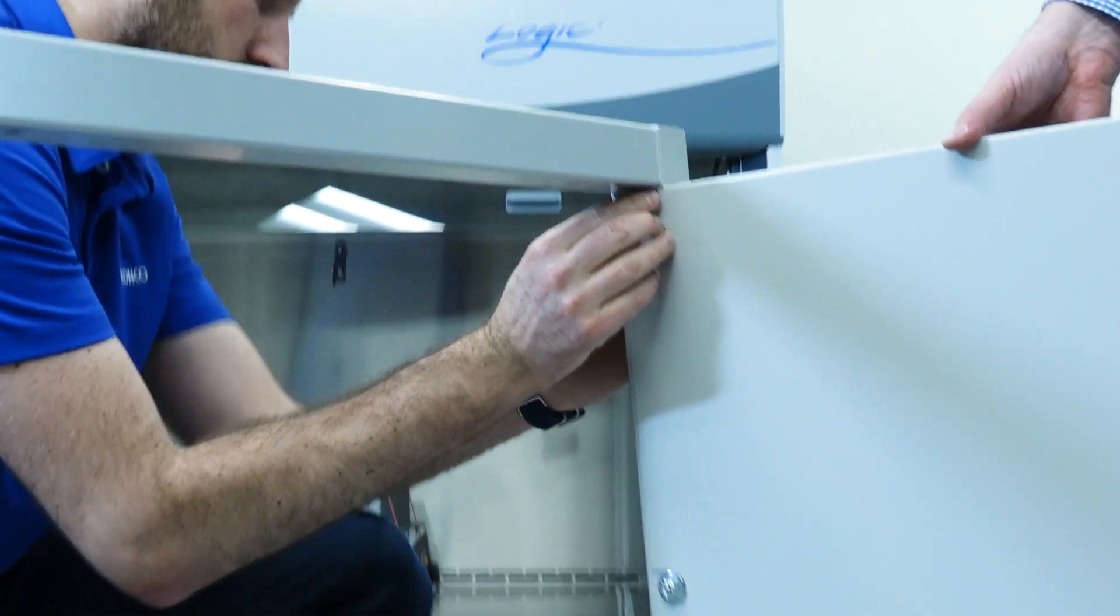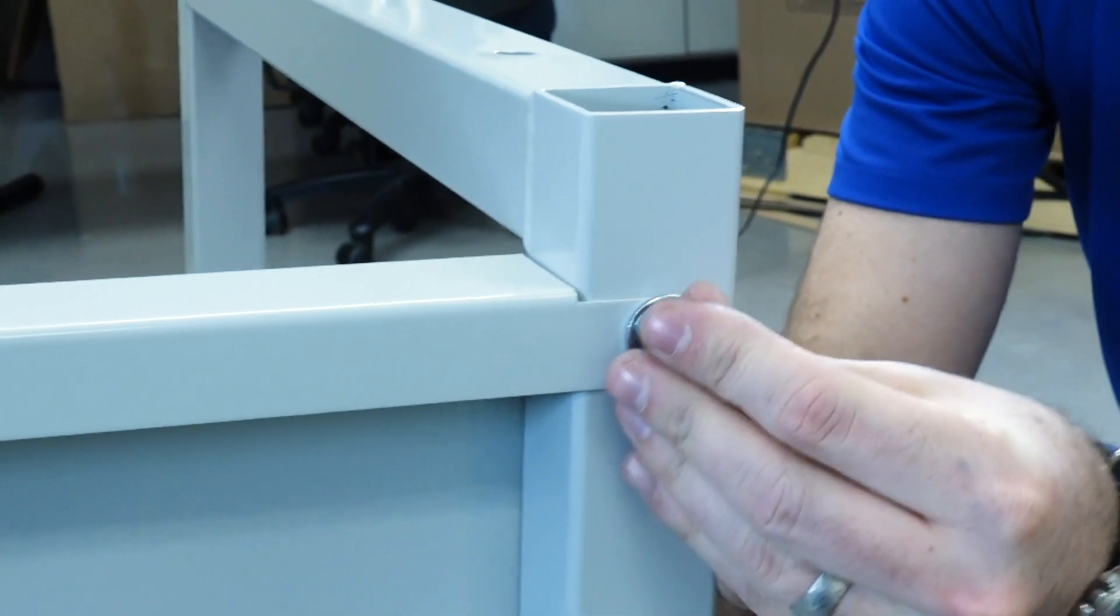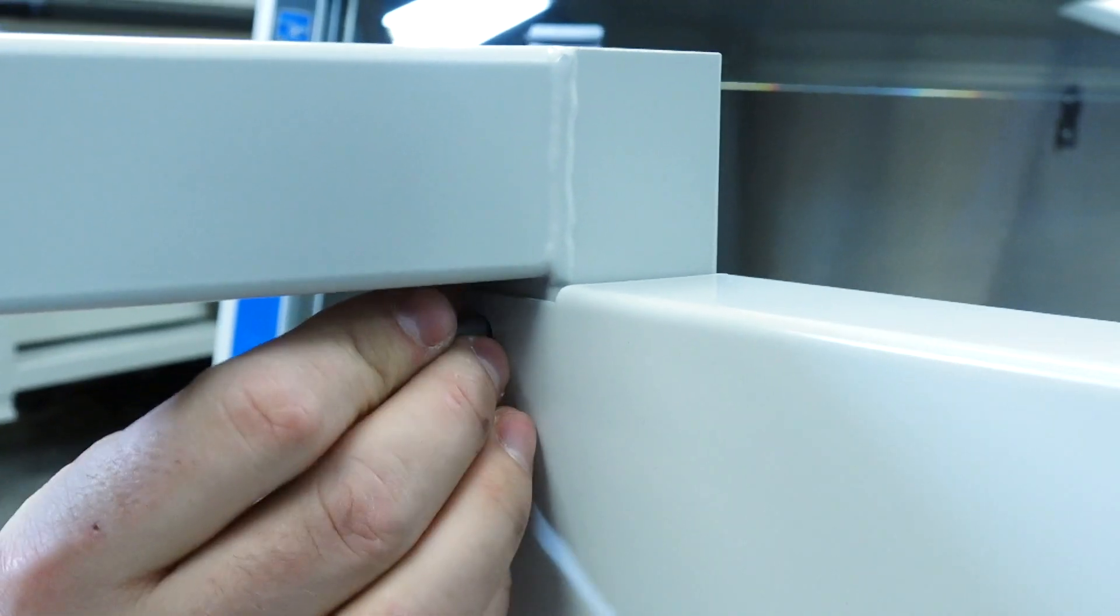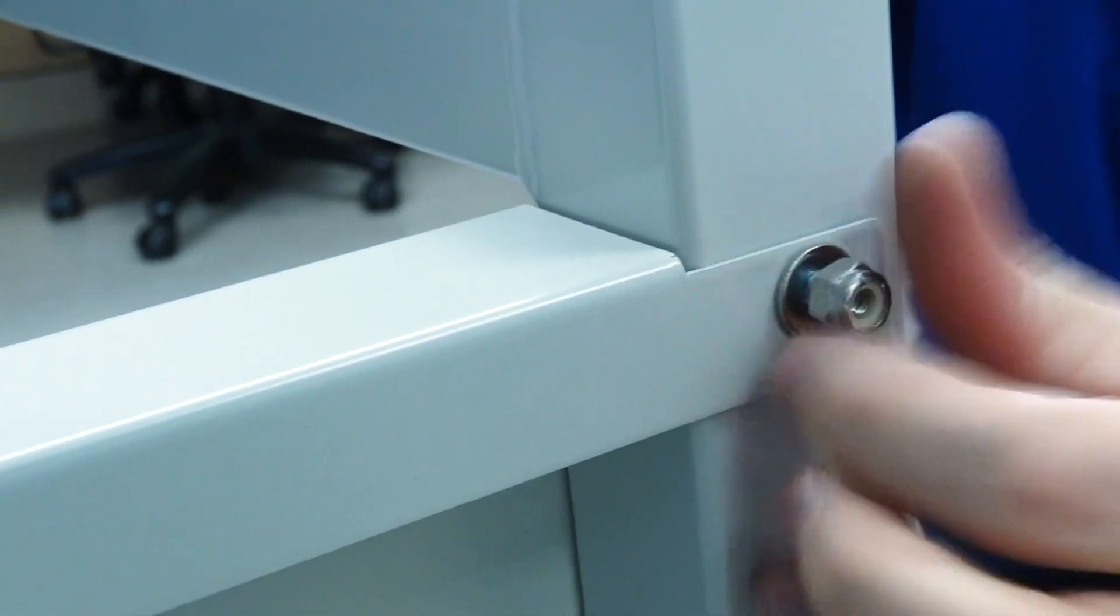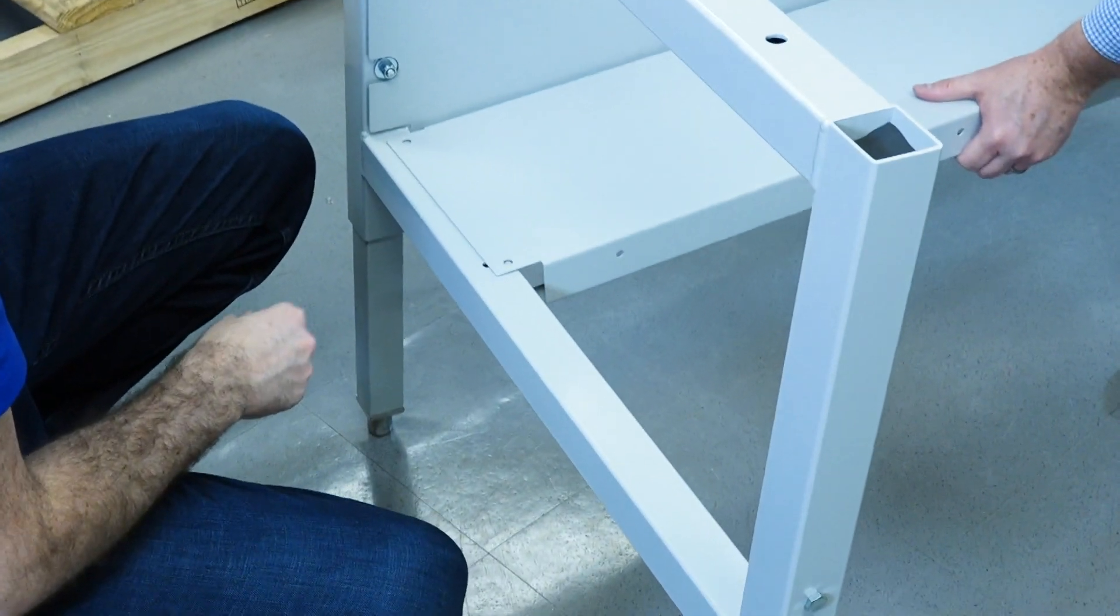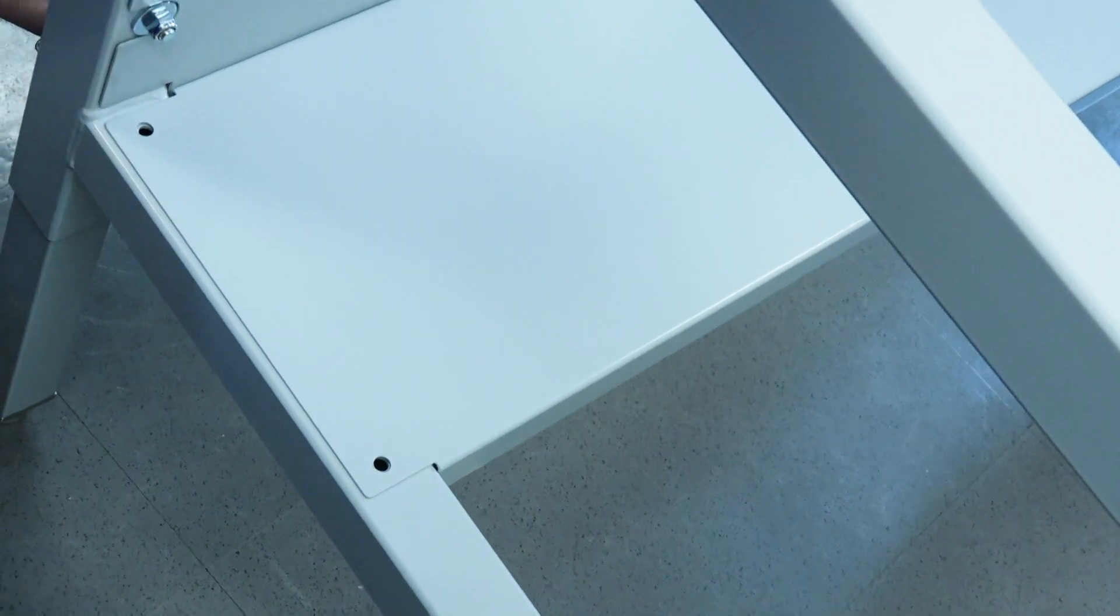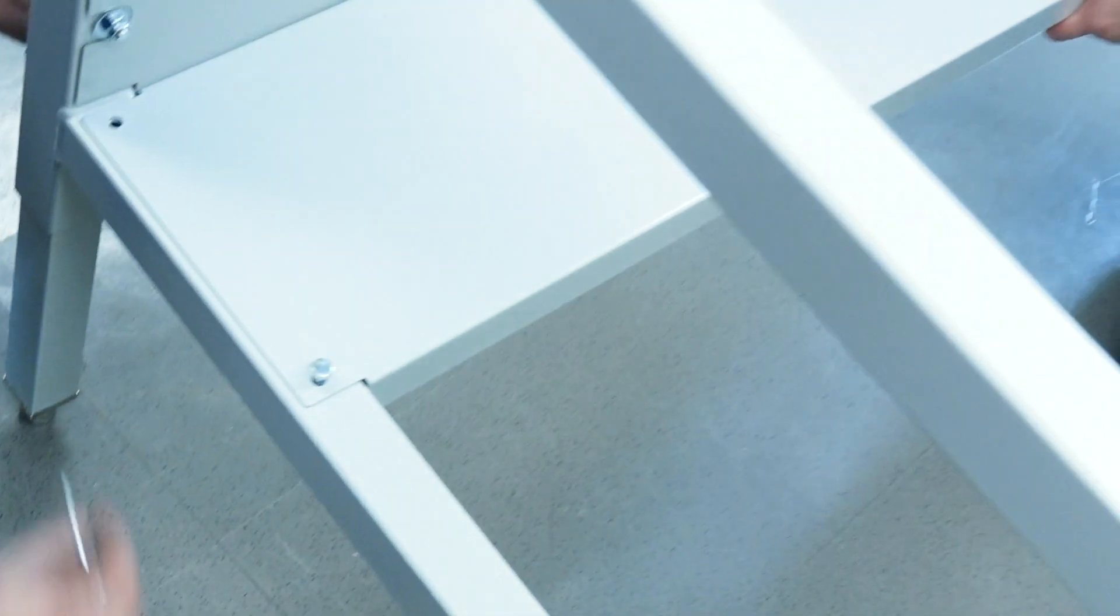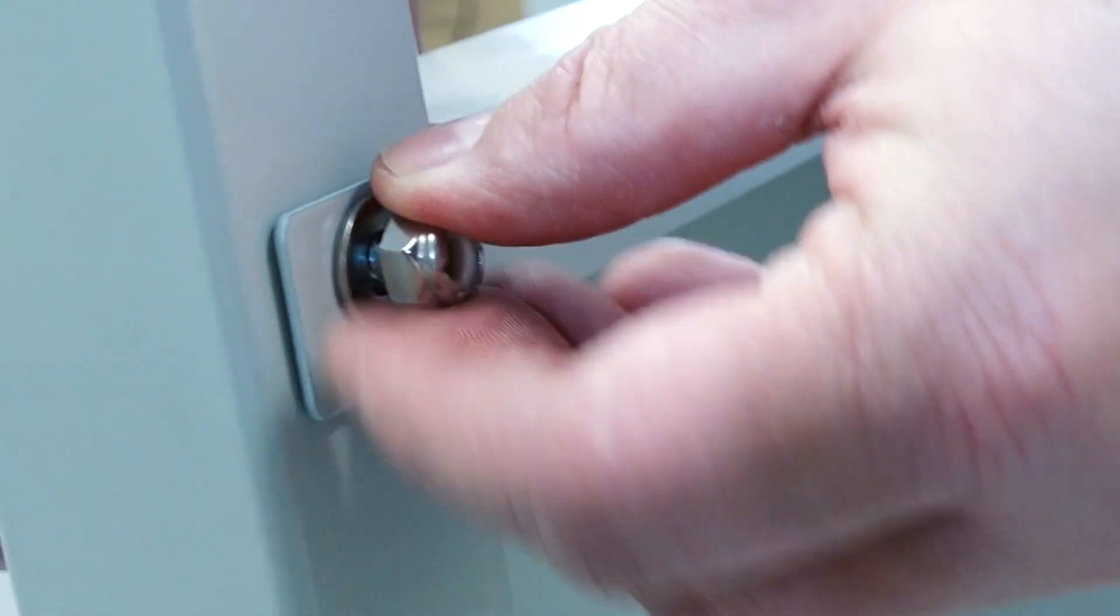Next, use three bolts to loosely attach the back panel and the bottom shelf to one leg assembly. Continue by attaching the other leg assembly with another three bolts.